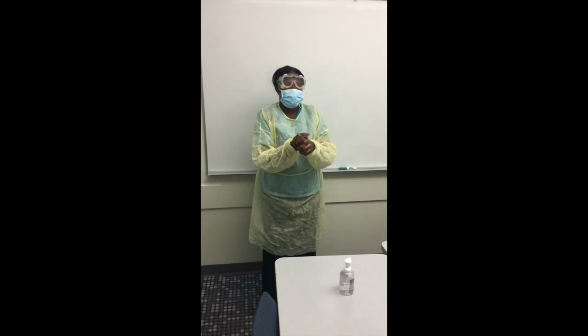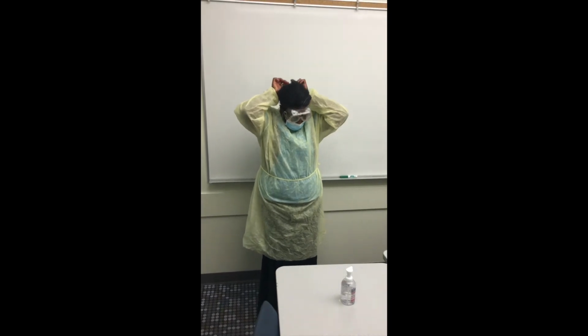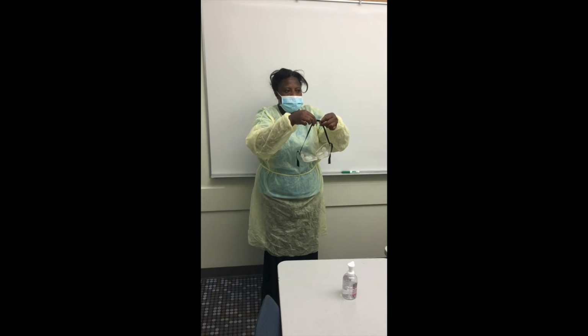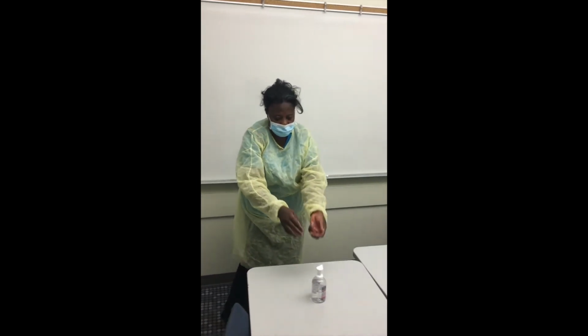Then remove the goggles, making sure to touch only the outer part above the ear and do not touch it from the front, and discard into the appropriate receptacle. Perform hand hygiene.